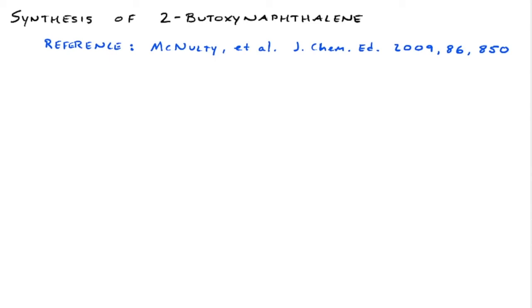So we are going to synthesize 2-butoxynaphthalene, and this is the literature reference for the reaction we're going to run. It's from McNulty and coworkers. It was published in the Journal of Chemical Education in 2009. So if you want to go check out that reference, there it is.